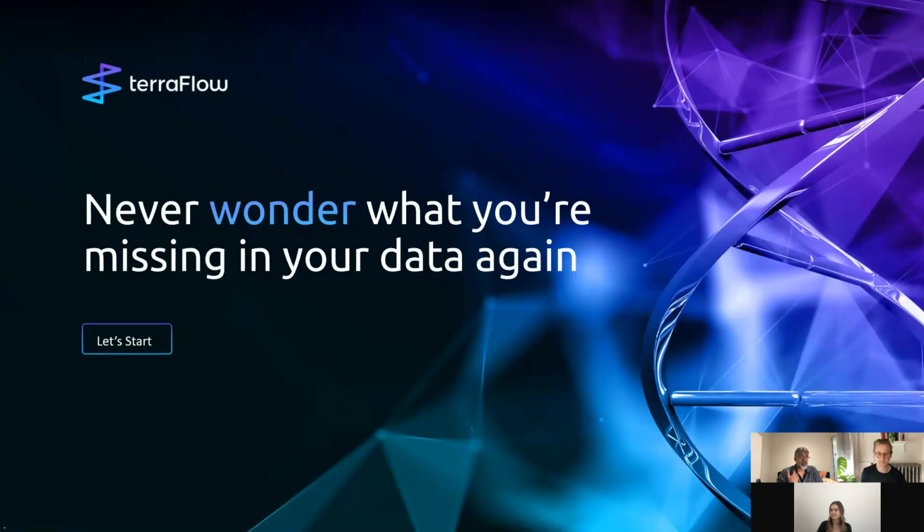One of the things that we've done with our data sets at Talon is that we've run one comparison through terraFlow, and then we've gone back and set up an additional comparison and run that through terraFlow. And so that's how we would approach this. We would probably use it as a second separate analysis.